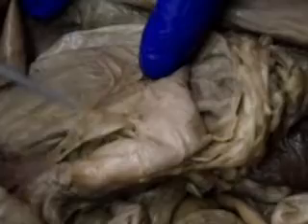This is the greater curvature of the stomach. This is the lesser curvature of the stomach. What we're seeing on the stomach as well is this fatty membrane right here, and this is the lesser omentum. It's around the lesser curvature. And then coming off the greater curvature of the stomach, we see this larger fatty membrane, and this is called the greater omentum. So that is the greater omentum. Associated with the greater omentum, we're seeing this organ right there, and that is the spleen. So that is the spleen.